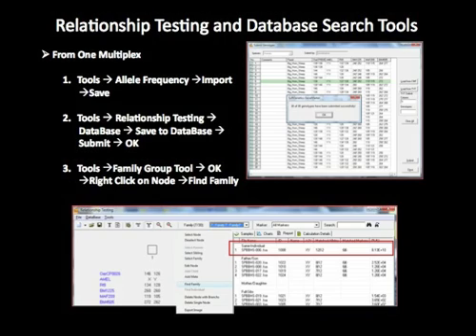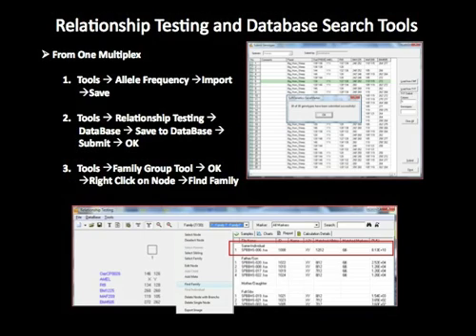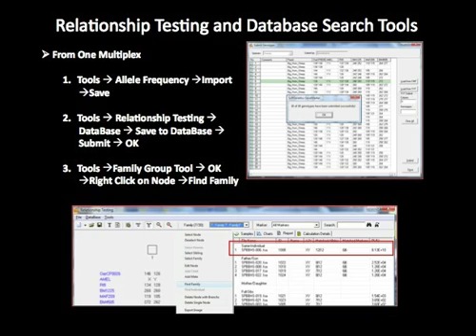The results of the database screen and identity by descent calculations are provided in the table with exact matches for the same sample individual. The likelihood ratio of this sample indicates that there is a 1 out of 8.36 times 10 to the 10th probability that there would be another random individual in that population with the same genotype. These files also had gender markers, amelogenin, so the potential father-son and mother-daughter files are also retrieved from the database and ranked.